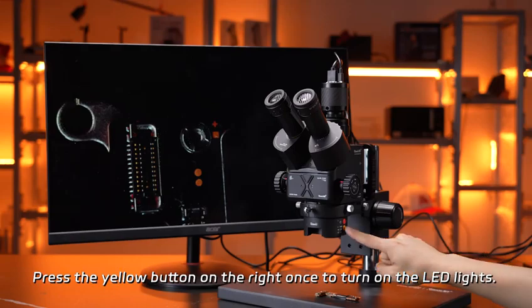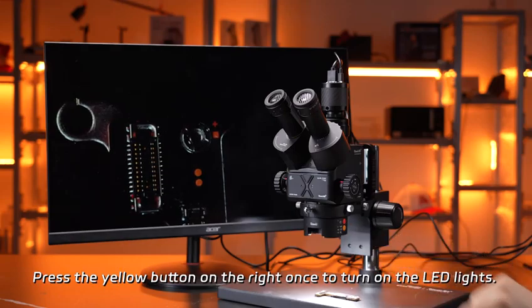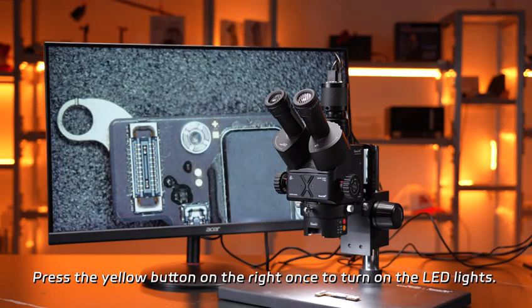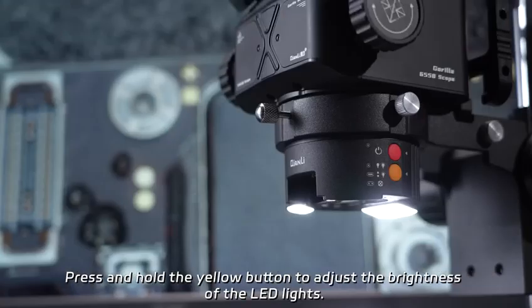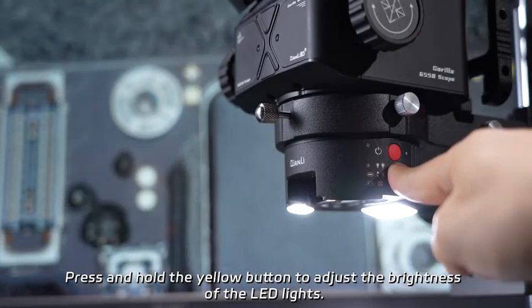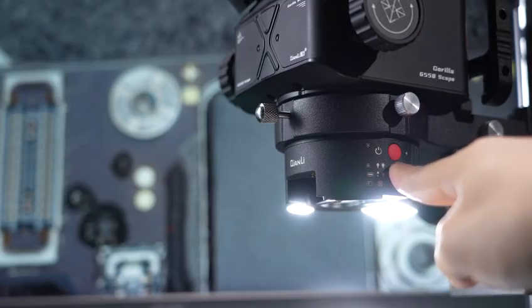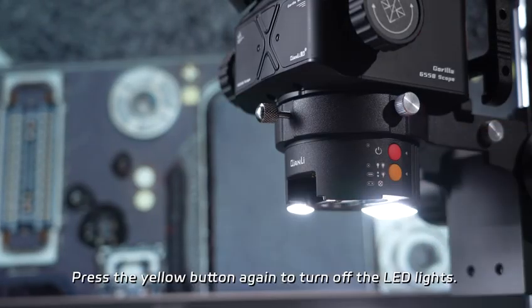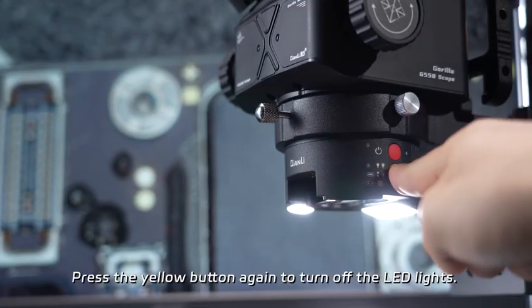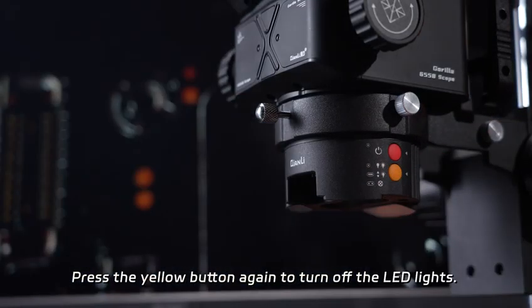Press the yellow button on the right once to turn on the LED lights. Press and hold the yellow button to adjust the brightness of the LED lights. Press the yellow button again to turn off the LED lights.